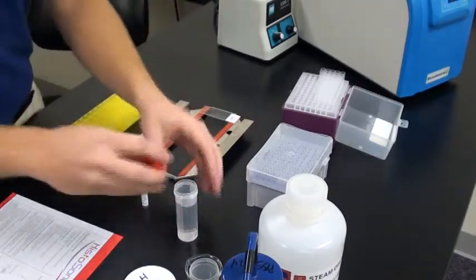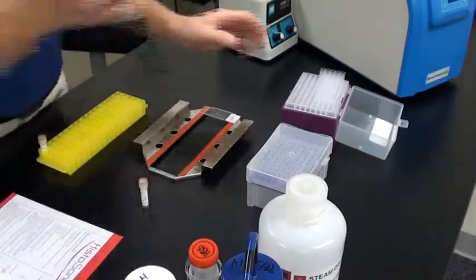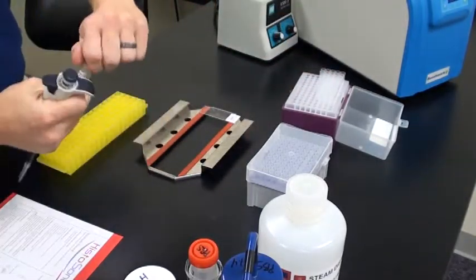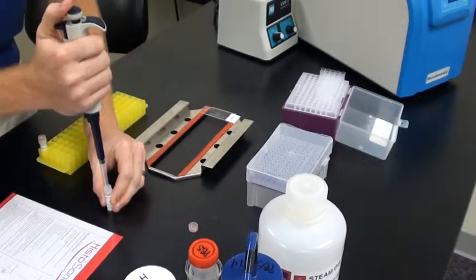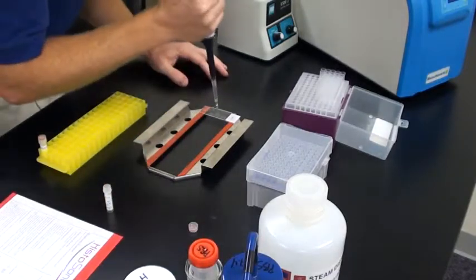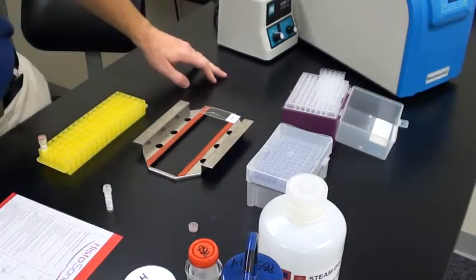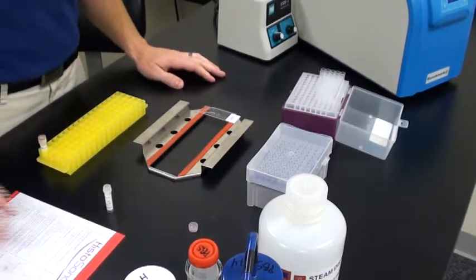So now that we have the slide on our ExISH Rail, we're going to pipette all 200 microliters of the proteinase K onto the tissue section. You want to be sure to cover that section completely so that we can digest all the ribonuclear proteins that would prevent us from finding our target. Now we're going to let that proteinase K sit on the slide for 10 minutes.